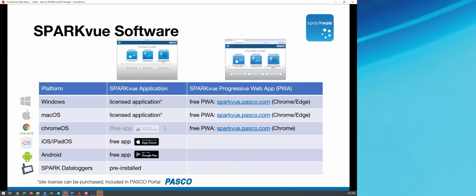But once you've connected Sensor, which is that difference, we'll be able to see that everything else functions the same. There's a question here about if you're on a Chromebook. I'm going to do a Chromebook in the third activity, but basically when you save using the main menu in SparkView from the Chromebook, you will have all the same options you do for file management, from the downloads folder to, by default, the Google Drive folder that your students may have.